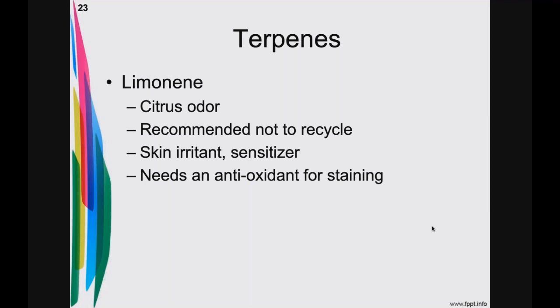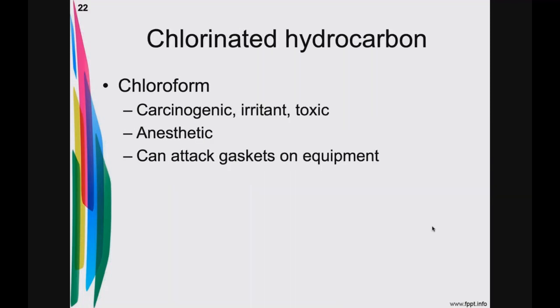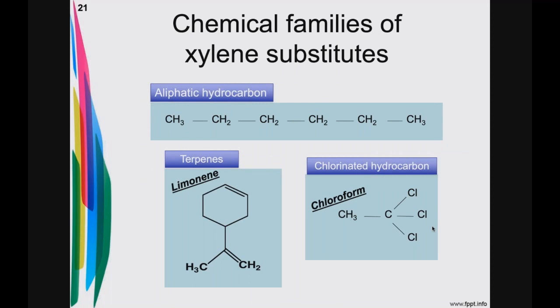Terpenes, this is the one that smells of citrus, all right? Limonene is orange oil. It's not recommended to be recycled, mainly because it's a plant product. And with plant products, since it's not synthetically made, there's a lot of molecules in there that make it difficult to realize how to do the settings. It is a skin irritant, a sensitizer. You're not going to find any of the xylene substitutes being totally safe. Because to be totally safe, the only thing that can be is water, and that's not going to be it. What the limonene and all the terpenes need, whether it's orange oil, lemon oil, lime oil, whatever, it must have an antioxidant added to it.